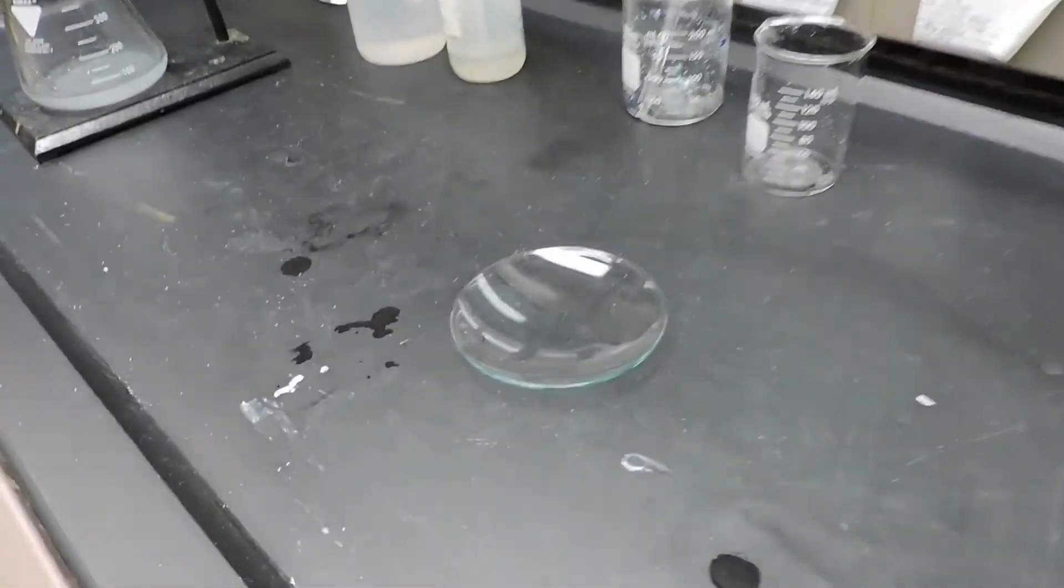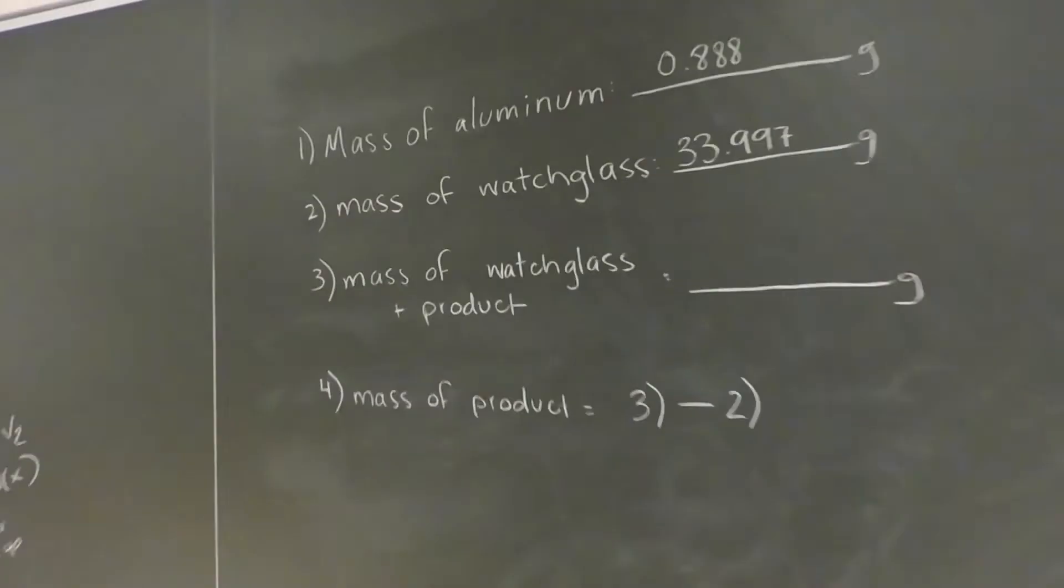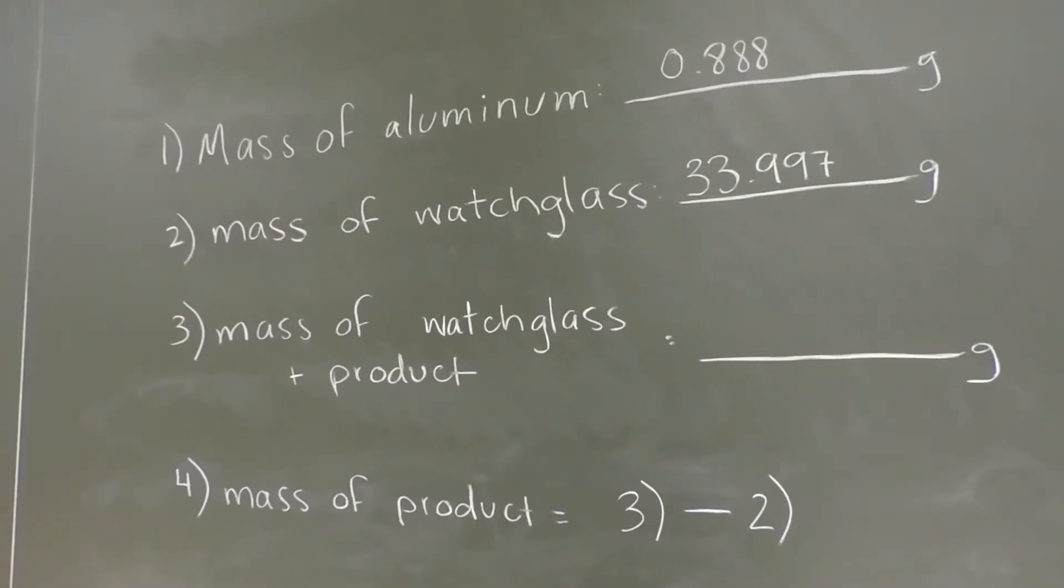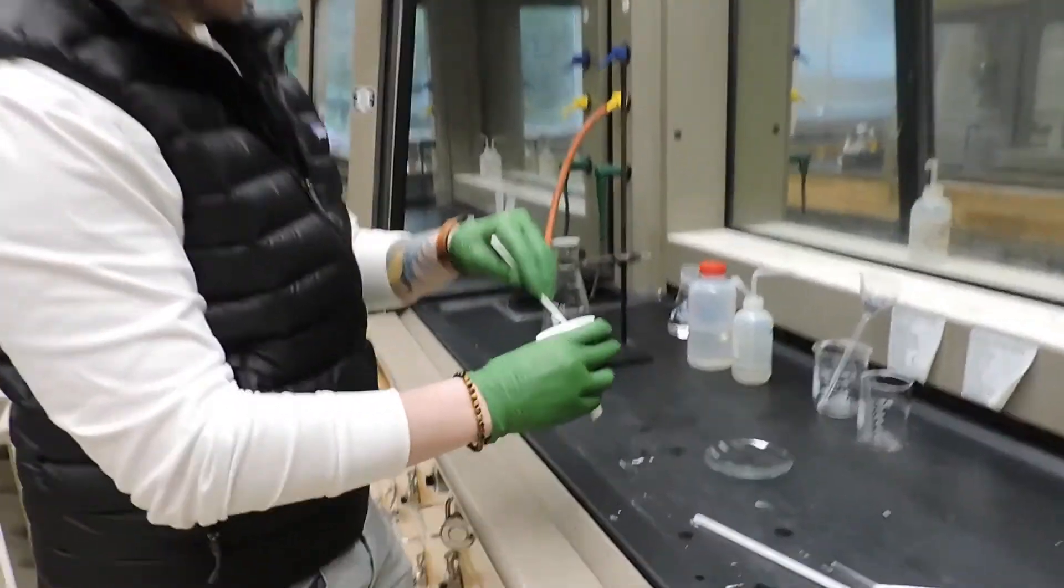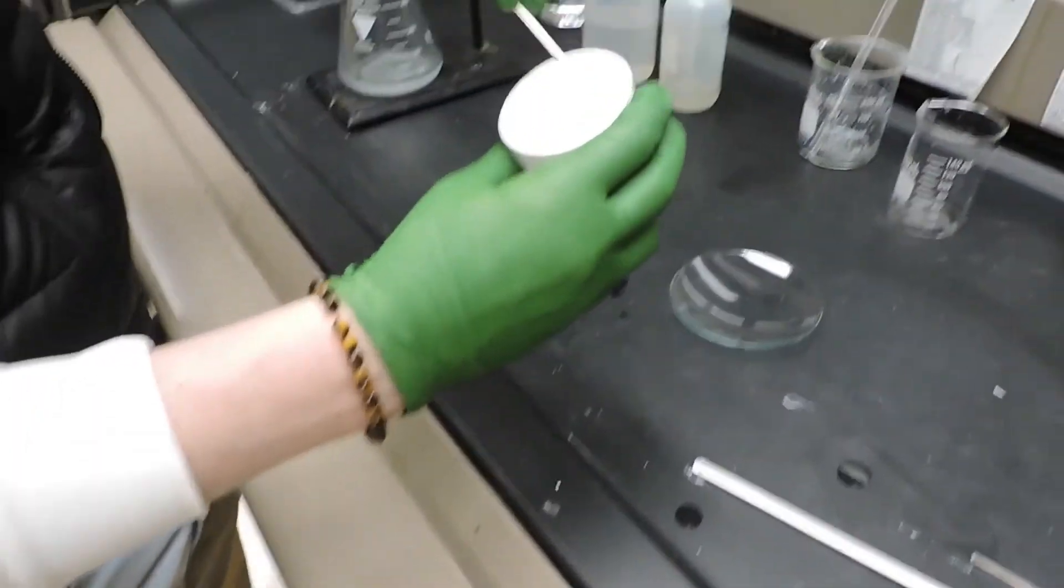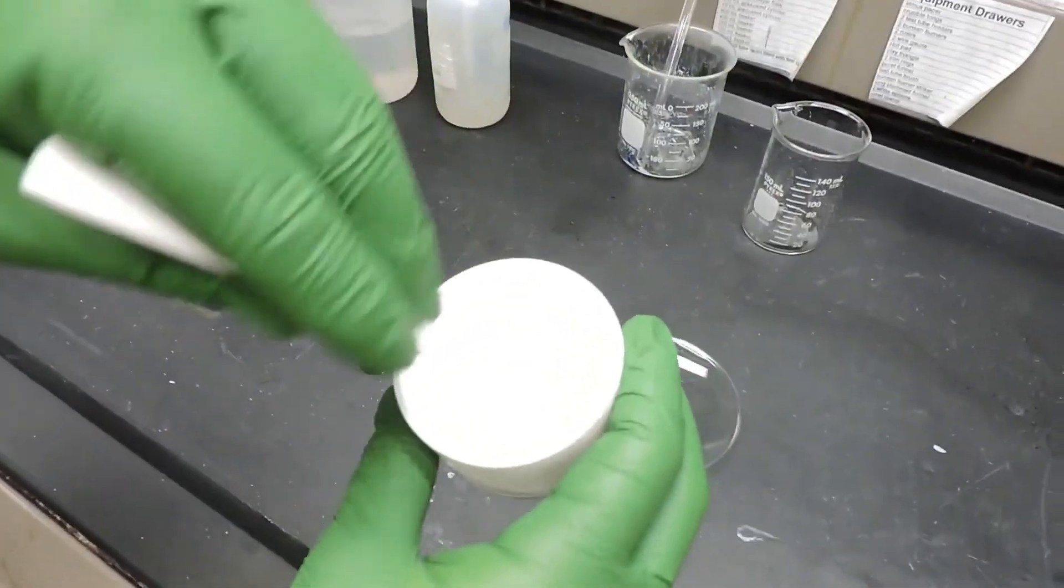So we've weighed a dry watch glass, and that mass is 33.997 grams. So now we're going to take our dry alum from the vacuum setup and use a spoon to scoop it onto the watch glass.